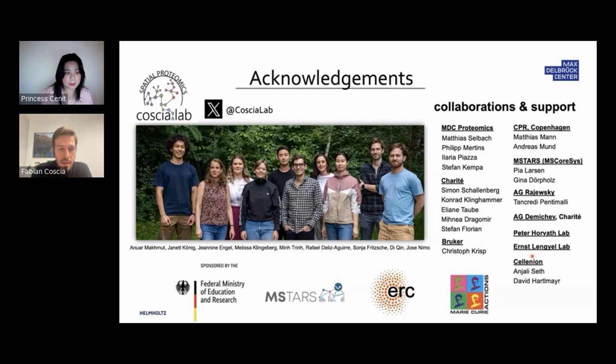Deep learning algorithms have completely revolutionized the way we can analyze proteomes to date. Without a deep learning-based algorithm, it would be very challenging to identify the majority of proteins in our raw data in the end. So this is one aspect of it.